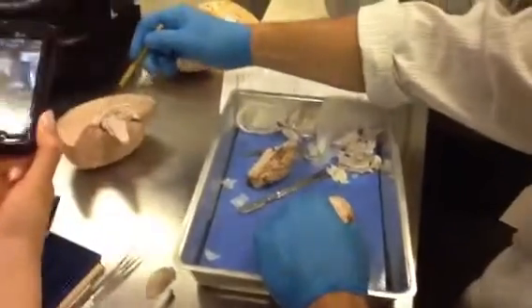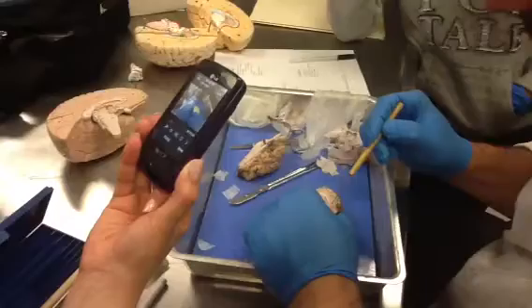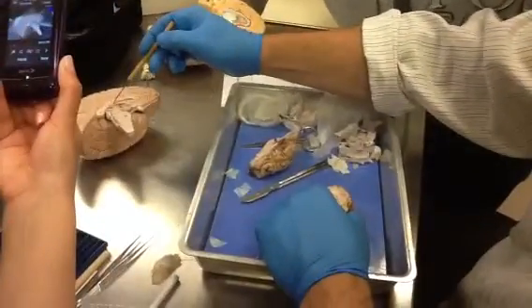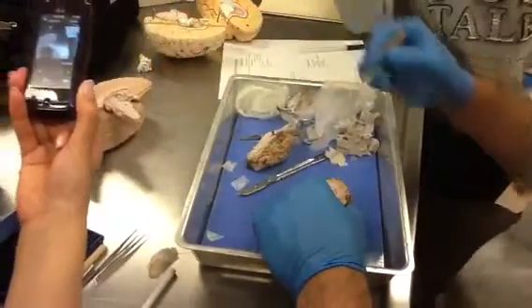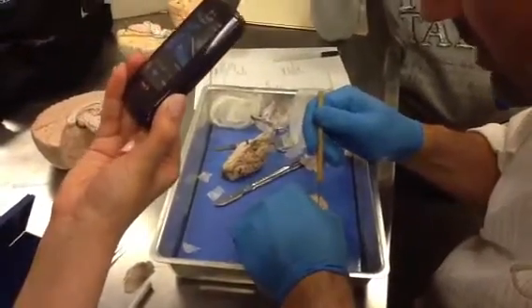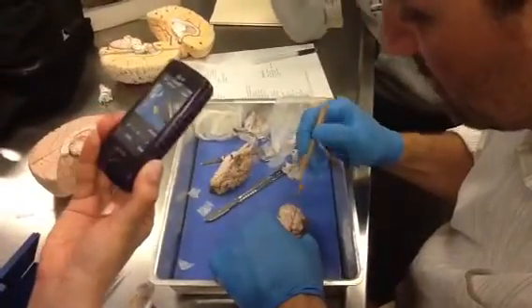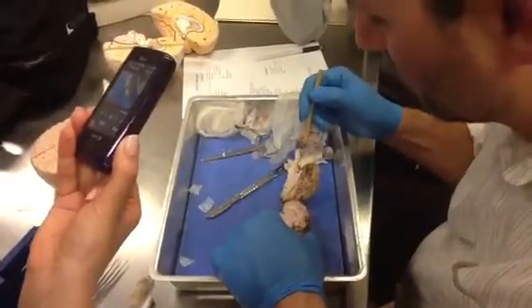Okay, so this is the corpus callosum. That's this part up here. And then this bottom part here, this is the fornix. I think it's number 12 on there. And then that's the little flap that would be there, the septum pellucidum. Okay, but it's actually removed here. And I can see inside the lateral ventricle, the choroid plexus capillaries, part of the thalamus in there. This little round area down here, we would call this the thalamus. Okay, this is the thalamus right down here below.